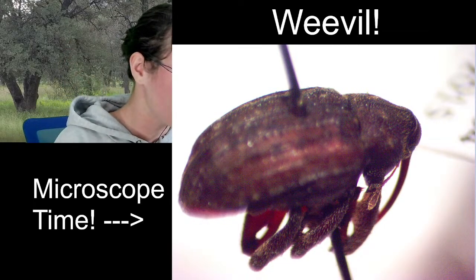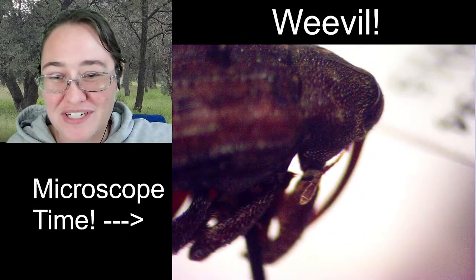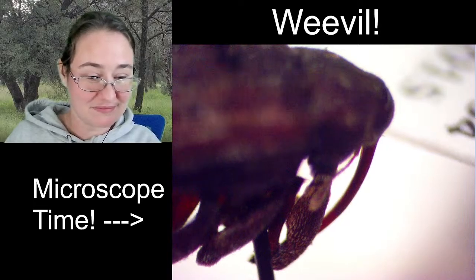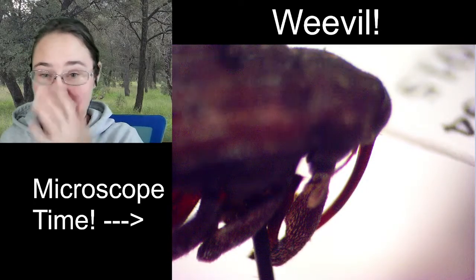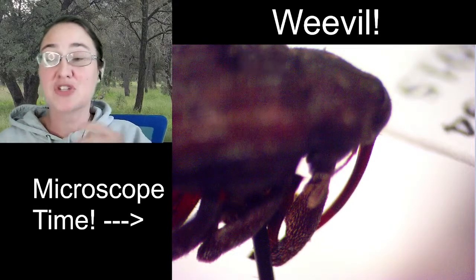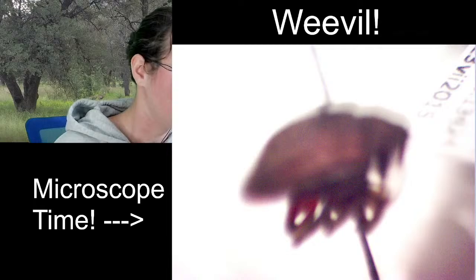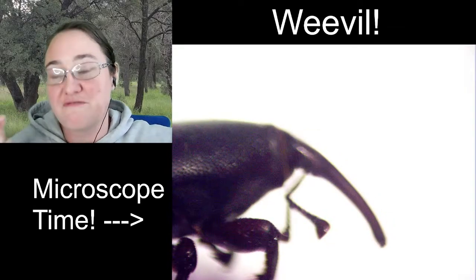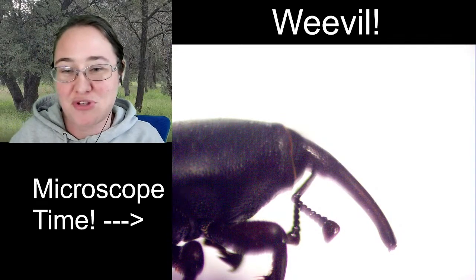It's a little excessive, but it's amazing. It's three or four times the length of its head? Well, I guess the snout is part of its head. The mouth parts are attached at the very end of the snout. So the whole snout is not the mouth part. A lot of times you can actually see that the antenna looks like it's coming off of the snout, because that snout is actually the whole face. And then they've got these little itty-bitty chewing mandibles at the very end of the snout.